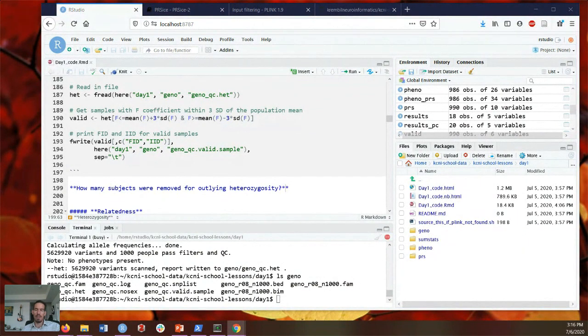Those who are on SciNet are doing a bit of a tricky thing. They're still ending up with RStudio. The reason for this is the workshop, so everyone's looking at the same thing. The windows look the same, just trying to keep it as uniform as possible. But you're certainly right. In many cases, it is not as efficient, and certainly for cases where you're dealing with very large files and very large outputs, to have your analysis embedded inside of an R Markdown object. For this case, I think it's quite useful.